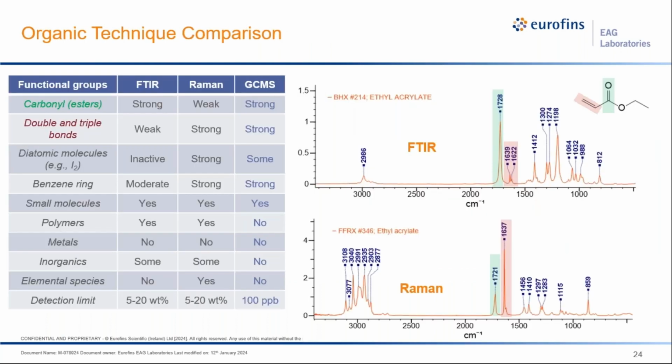And generally speaking, when we compare these 3 techniques, we can see that they excel for certain characterization and are not as good for others. And there's kind of a guiding principle for it. So comparing FTIR and Raman, FTIR is very sensitive to molecules that have a dipole, that have electron density being pulled away. So in this example, we have ethyl acrylate, right, which has this carbonyl. This carbonyl has a strong dipole, and that is why this molecule is going to have a very strong peak in FTIR, but a more muted peak in Raman.